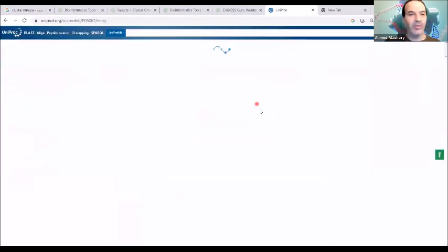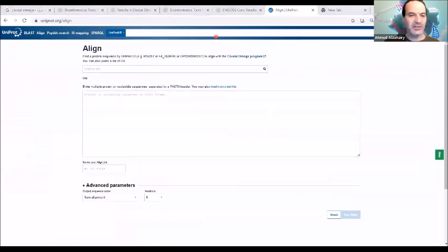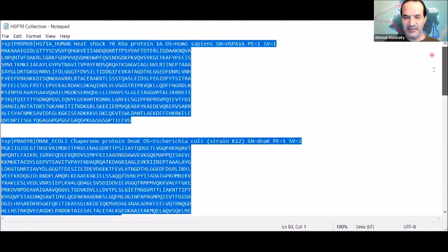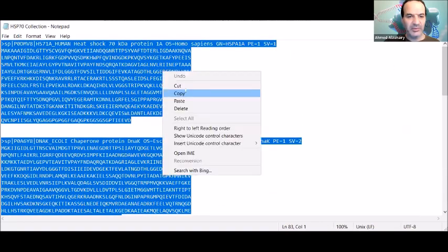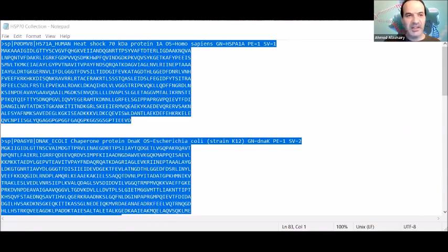You can use the align option here, put the sequences you extracted, collect many sequences, copy them, and then go to align sequences using Uniprot — which uses Clustal Omega. The same tool exists in both the EBI website and Uniprot, but you will see the difference. I copy and paste the sequences and then press align sequences.